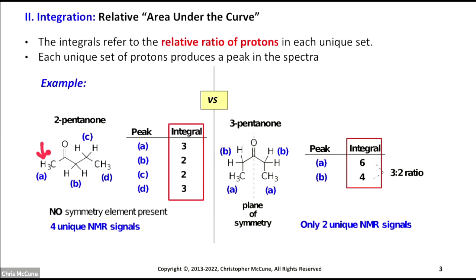And you can see how many hydrogens are responsible for peak A and how many are responsible for B. If I tell you that these 2 hydrogens for B are going to be enantiotopic, so they're NMR equivalent, but they're different than C because they're connected differently, right? This carbon is next to a carbonyl. This carbon is not.